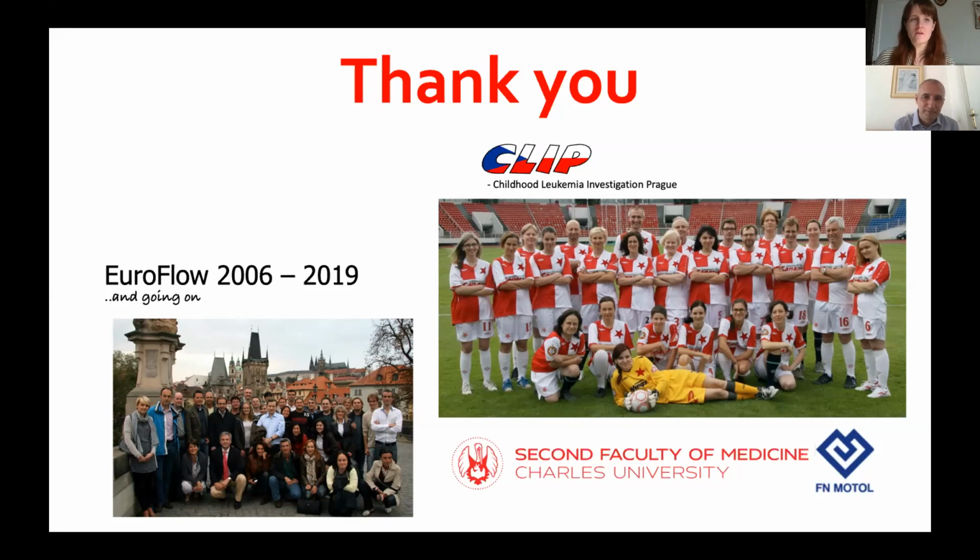And then one thing I was curious about is, you showed the comparison across instruments, right? And that you can run the same assay across instruments, which is a wonderful thing. I'm just curious if you saw any major differences of note or any observations across PMT-based instruments and APD-based instruments? So you showed the Cytoflex, and that's APD-based, and then some of the more traditional PMT-based. Do you have any observations there, or not really?